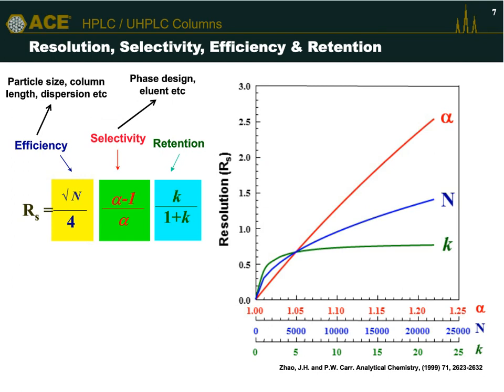Now, of course, efficiency and retention factor are also important in chromatography, but in terms of the power of resolution, alpha is the key.